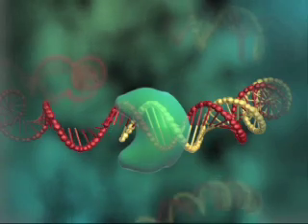Ion Torrent uses a high-density array of micro-machined wells to perform this simple biochemical process in a massively parallel way.